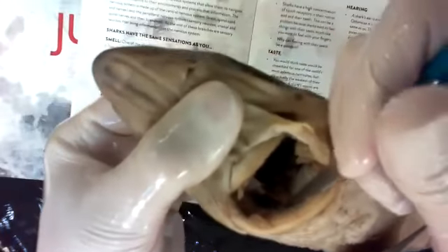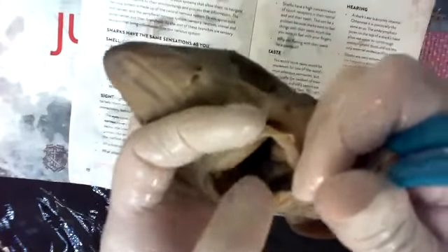All right, so taste. And then hearing. Oh, sorry, that was touch. On to taste. If you open up the mouth, you can use your scissors or tweezers and pull back. There's the tongue, right? That's where taste is at, right? Just on you, not on a shark.